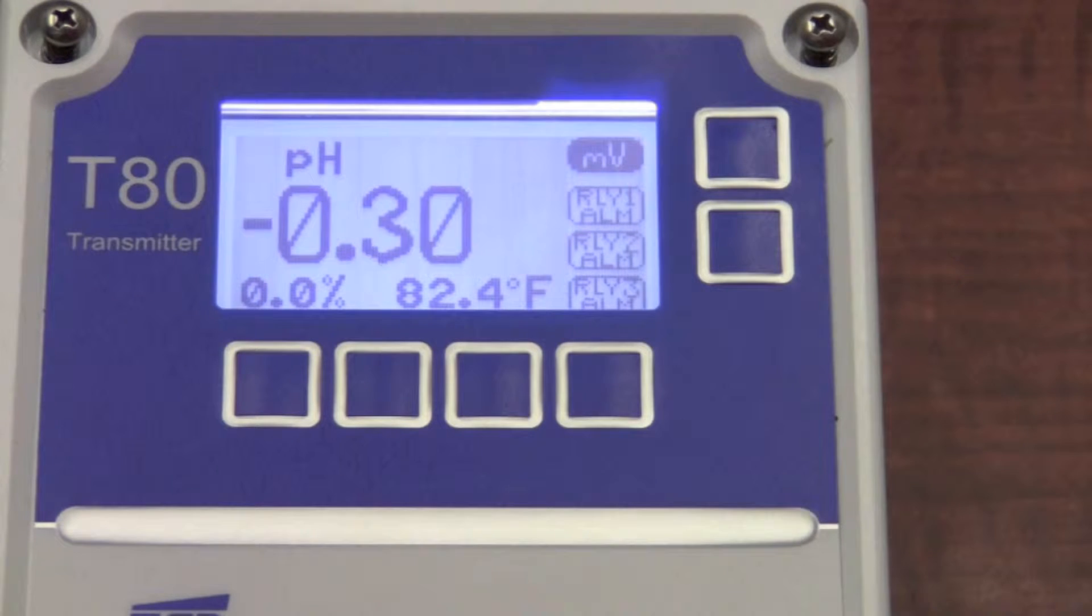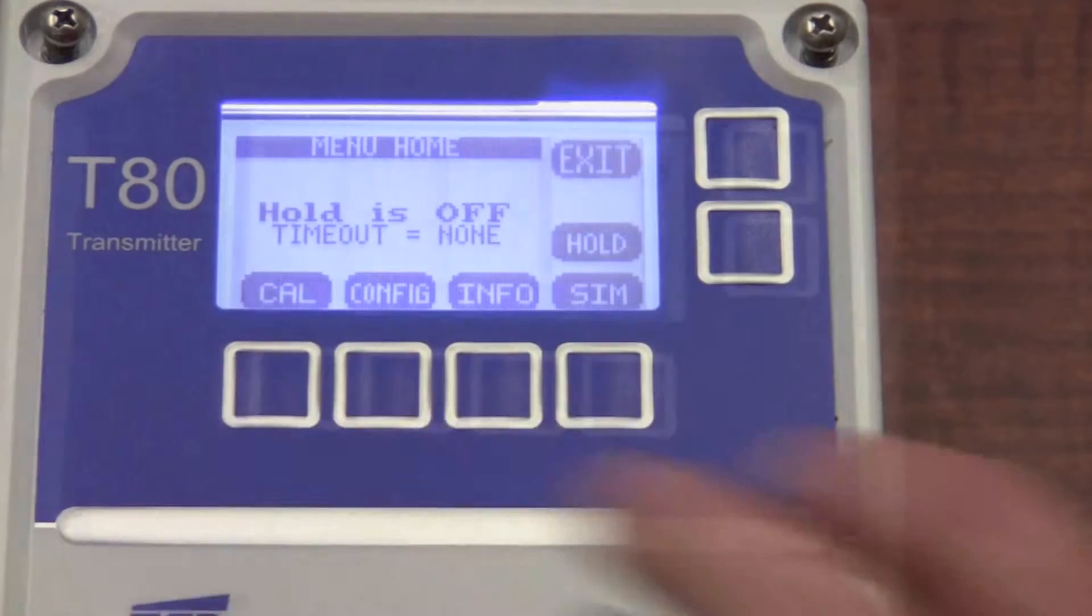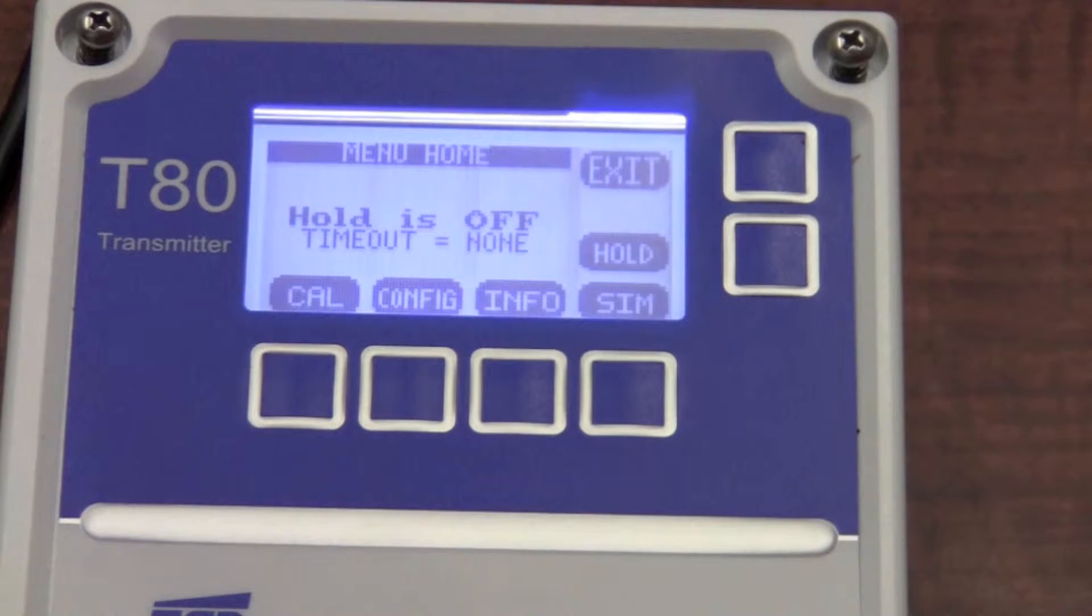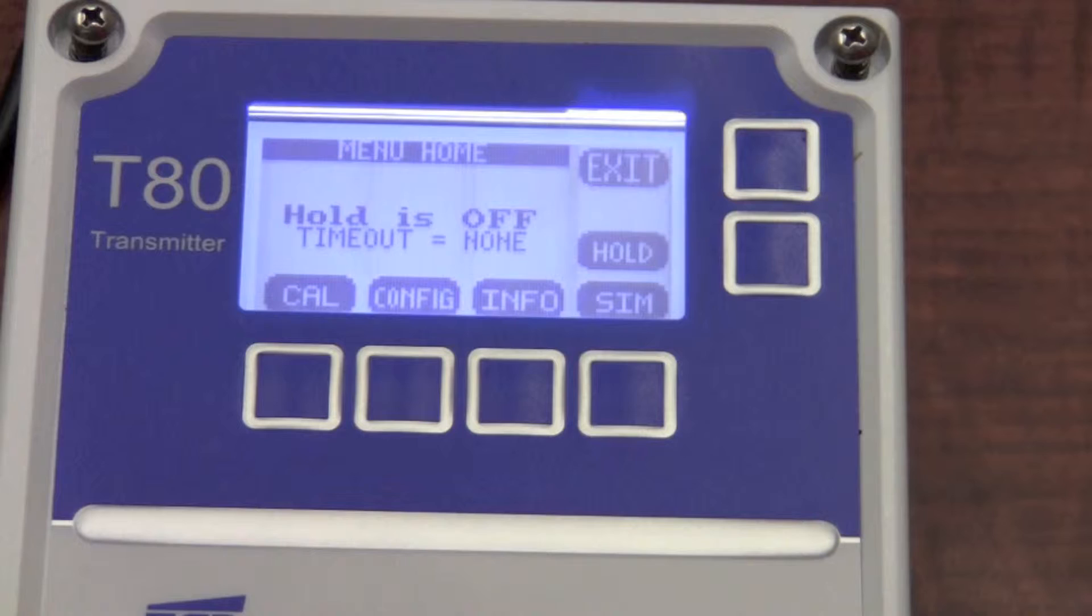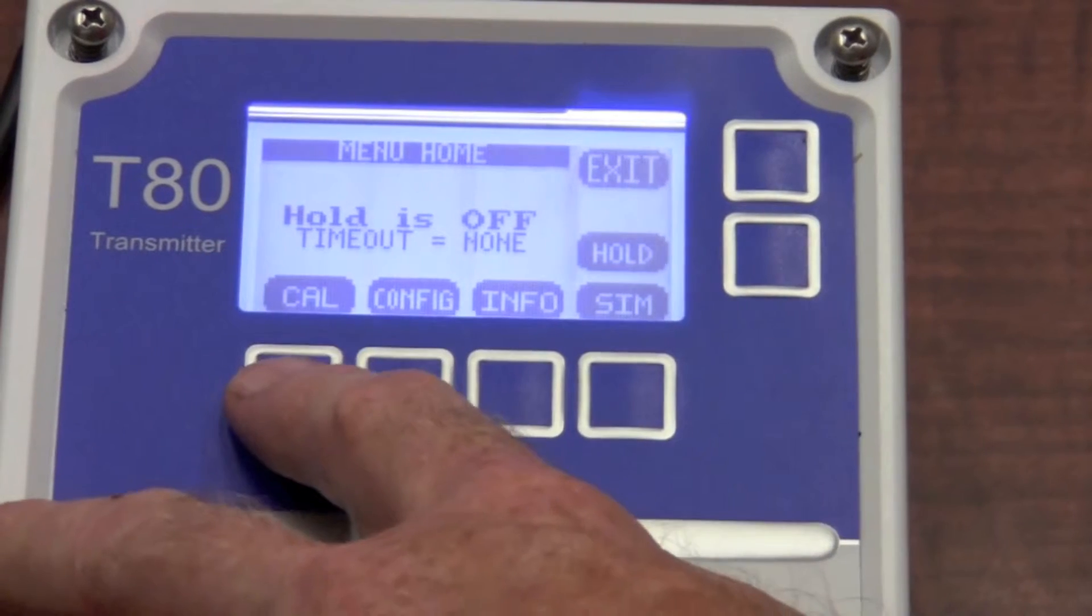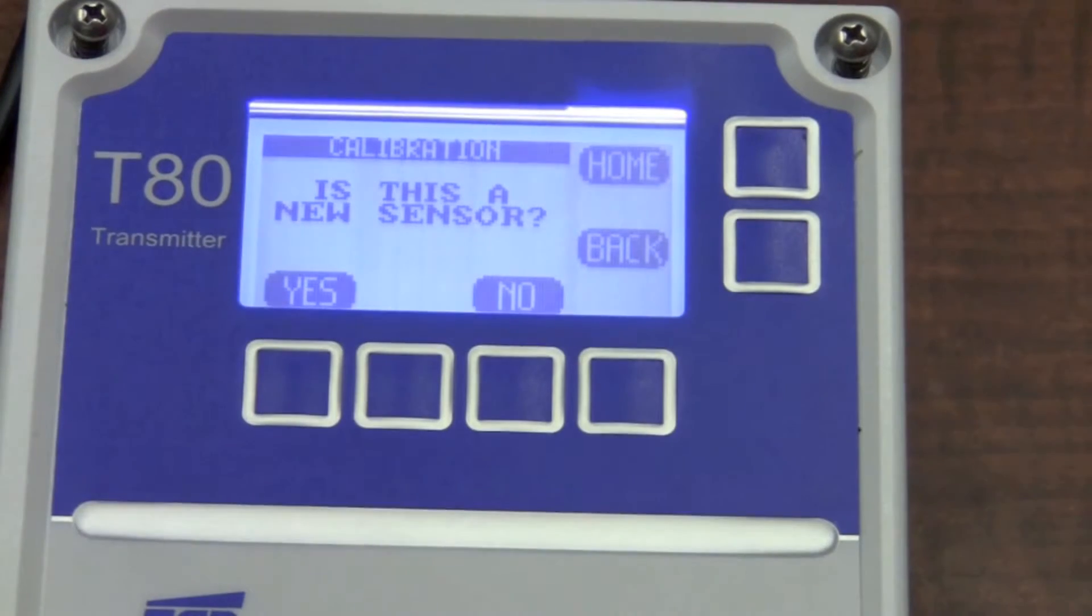Now, on the front of the display, I have four keys, and they become soft keys. Hitting any one of those keys twice in succession puts it into the configuration menu. After depressing the button twice, I have definitions for each of the four soft keys. For our intents and purposes, we're going to cover the calibration. By depressing the far left-hand key for calibration, it's going to ask me if this is a new sensor.